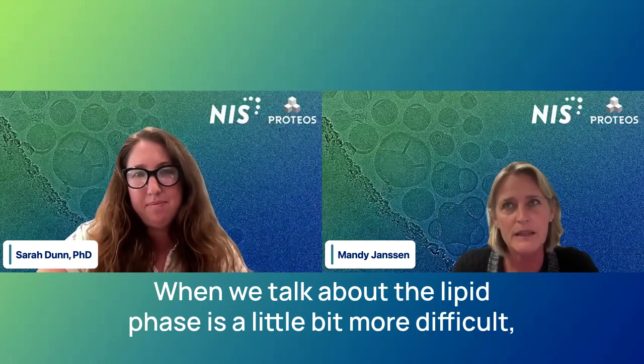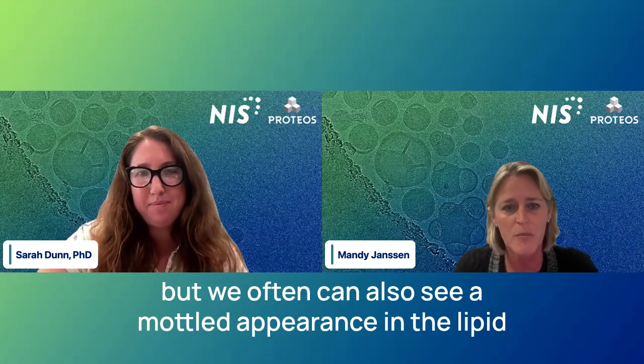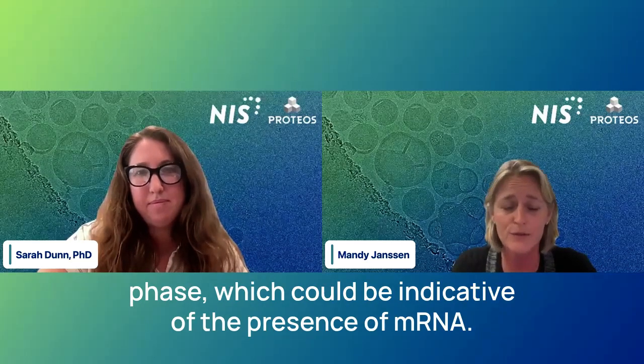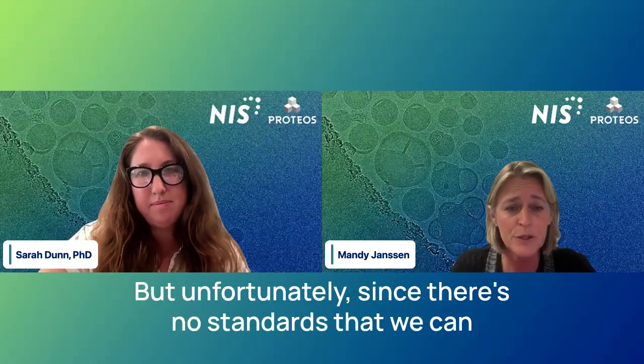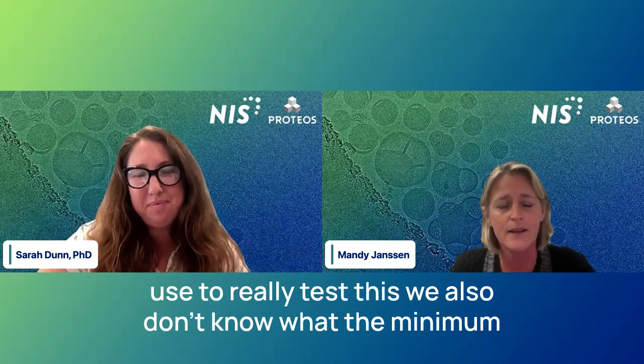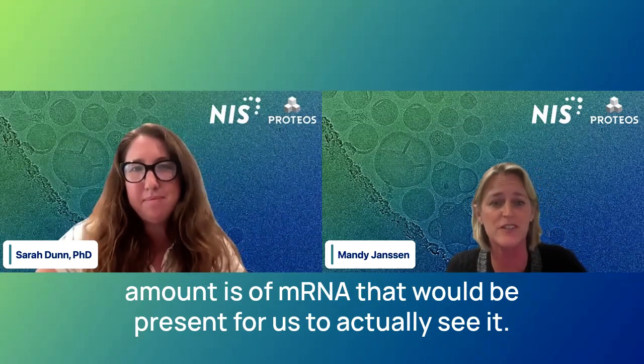When we talk about the lipid phase, it's a little bit more difficult, but we often can also see a mottled appearance in the lipid phase, which could be indicative of the presence of mRNA. But unfortunately, since there are no standards that we can use to really test this, we also don't know the minimum amount of mRNA that would need to be present for us to actually see it.